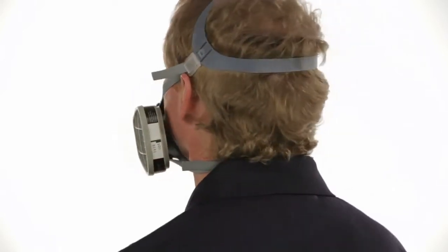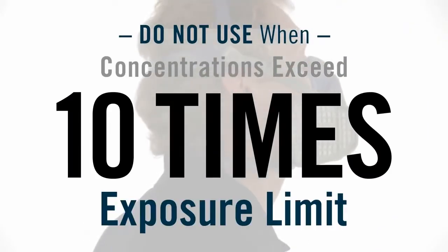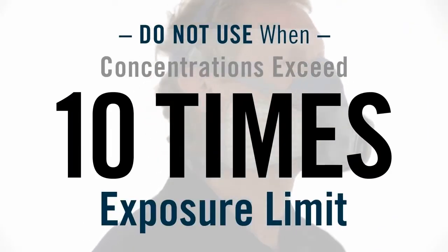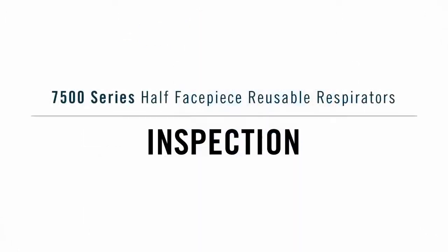Do not use your half facepiece respirator for concentrations of contaminants which are immediately dangerous to life and health, are unknown, when concentrations exceed 10 times the applicable exposure limit, or in atmospheres containing less than 19.5% oxygen. If you have any questions about which respirator and filters are appropriate for your respiratory hazards, consult your supervisor or trainer. If you don't follow all of the instructions and observe the limitations for your type of respirator, you could reduce the effectiveness of your respirator and take a needless risk with your health.